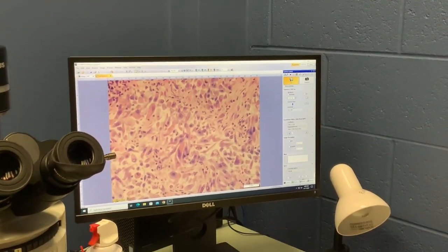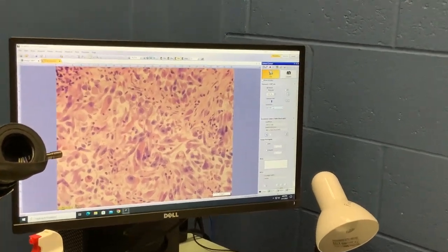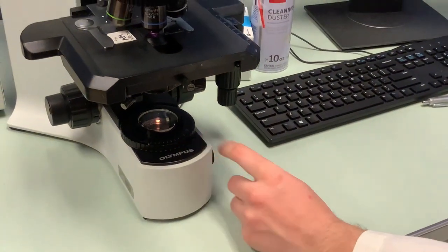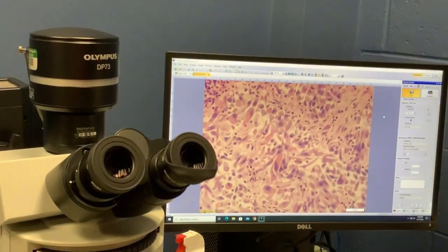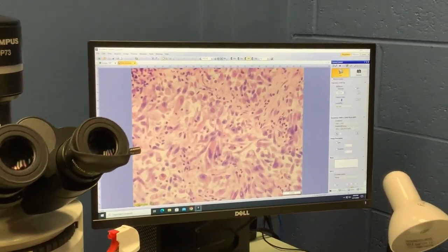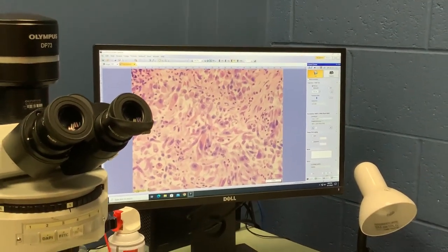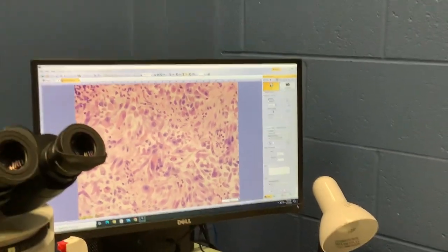There are some exposure controls and sensitivity controls you can change. But honestly, most of what you're going to be able to do for bright field is just with the actual diaphragm and your brightness control. You can adjust exposure time if you need to, but most of the time you will not need that. There are also a few different options in terms of resolution, but I typically leave this as is.